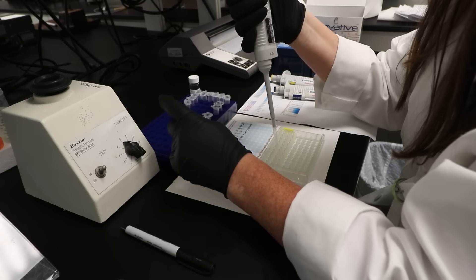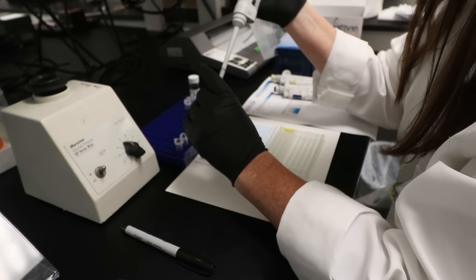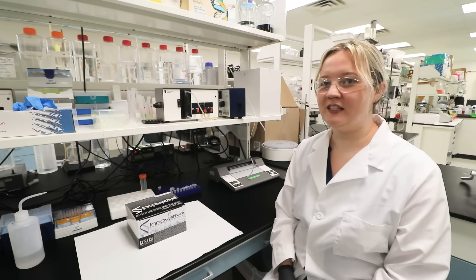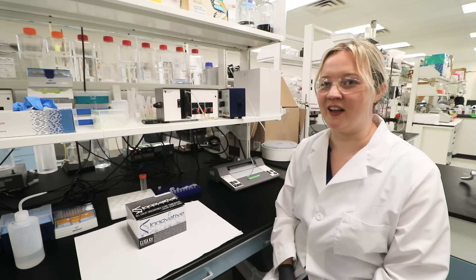Based on the standard curve, you can determine the concentration of IgG in your unknown samples. As a reference, the concentration of IgG in normal human serum ranges from 5 to 12 milligrams per milliliter. Remember to take all precautions and handle the reagents carefully. With proper execution, you can achieve accurate and reliable results using Innovative Research's human IgG ELISA kit.